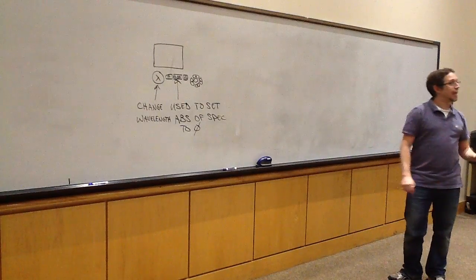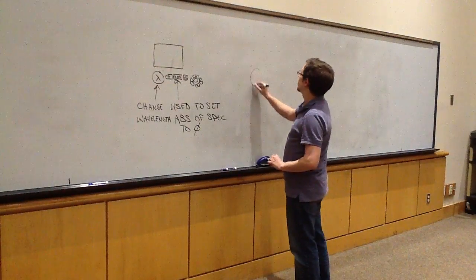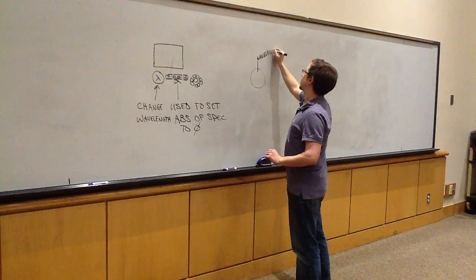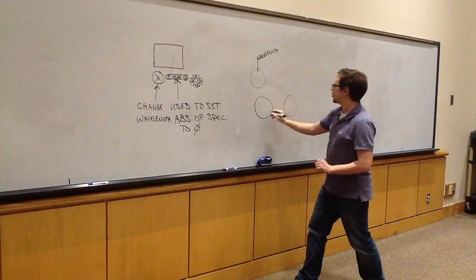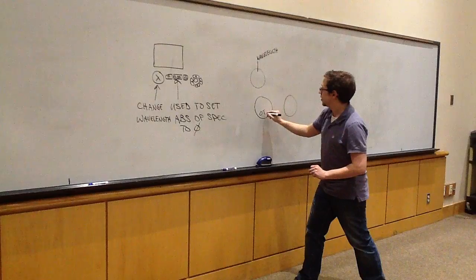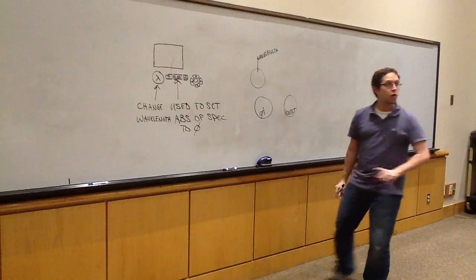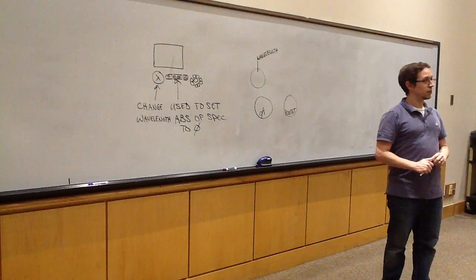Now, if you went to another campus, you had a slightly different kind of setup. At the other campus, you had a knob labeled wavelength. I bet you guys can't guess what that one does. And then beyond that, you had 2 other knobs, one labeled 0 T, and the other labeled 100% T. Now, you're only going to be tested over the spectrophotometer that you use. So people from Spring Creek, you're only going to be tested over the one that we used here. People from other campuses, you're only going to be tested over the one that you guys use.